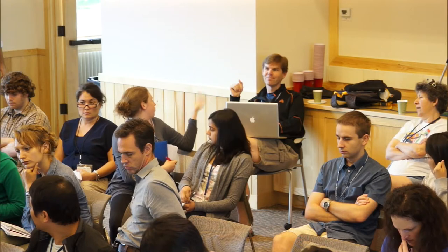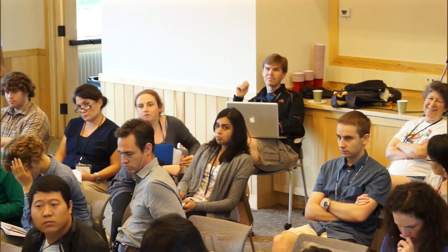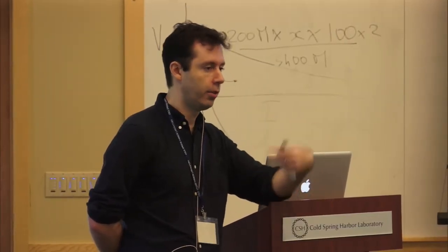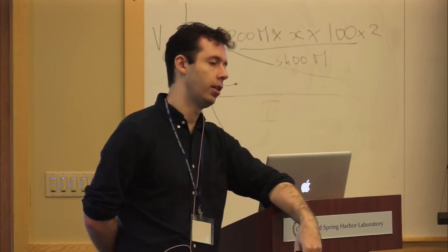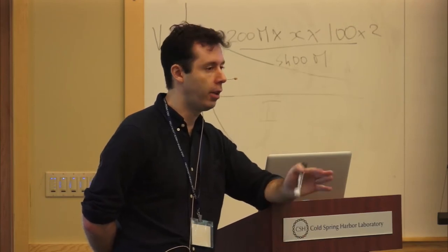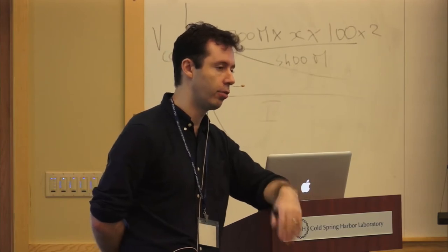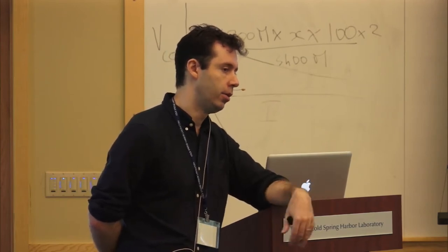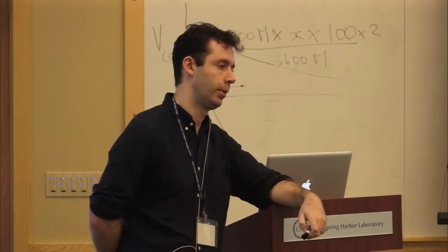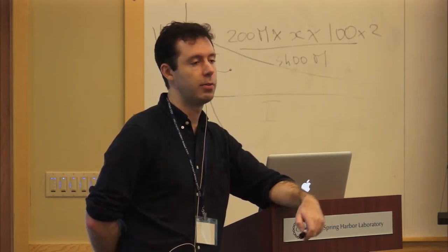And it's still, you know, the quality was good for the reads that you see, but the ones that you don't see. Yeah, but you normalize by the number of reads that you map, though. I mean, all of these FPKMs, RPKMs, there's a normalization by the total number of reads that you sequence. So that helps if you have a sample that tends to have, on average, lower mapping quality and fewer reads. You normalize by the total number of reads and you can get back to a scale that you can compare. But that's also not for any particular region. It's not region specific.